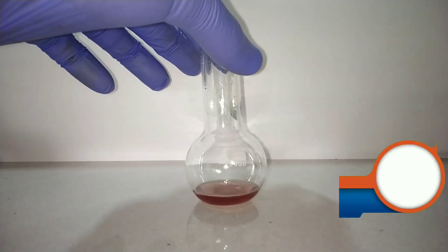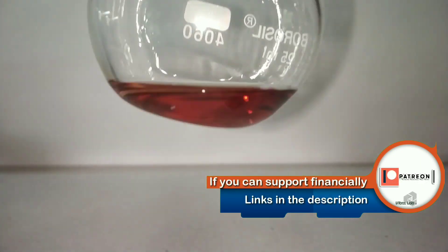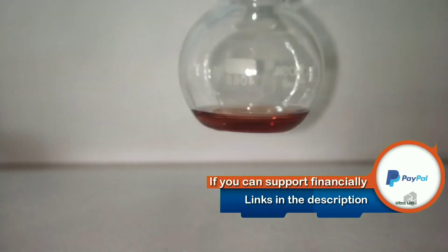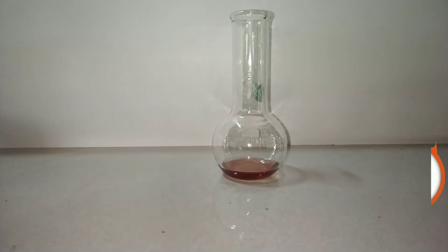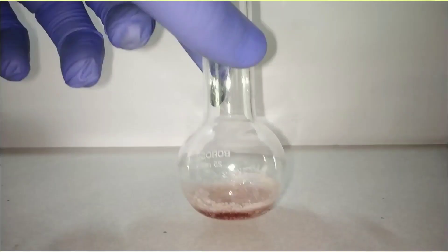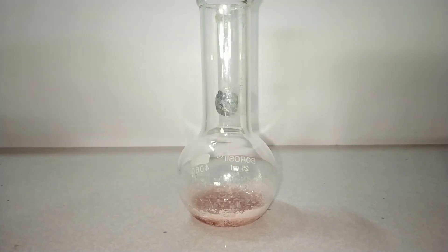After 5 minutes we take it off from the boiling water bath and keep it in room temperature to cool. Here we have the hot solution which is just taken out from the water bath and it has a cherry red color. After cooling we can see the crystals of crude acetanilide formed.